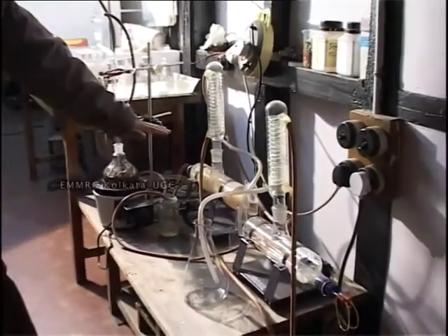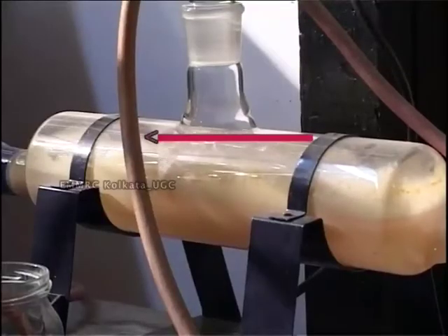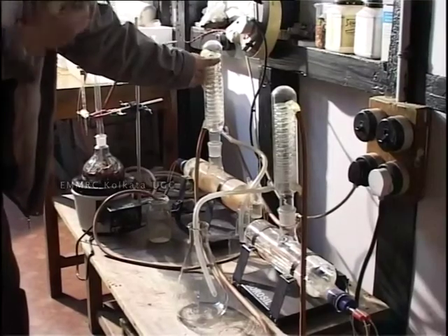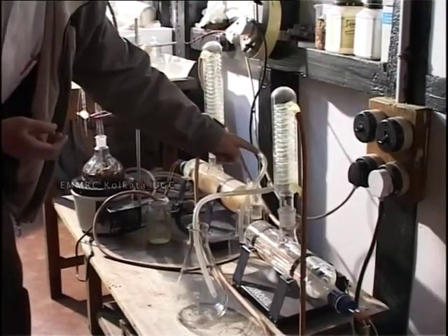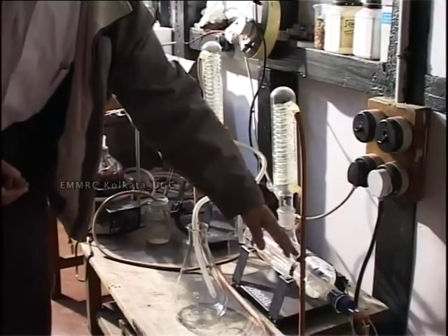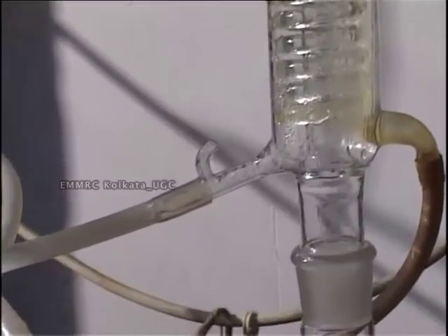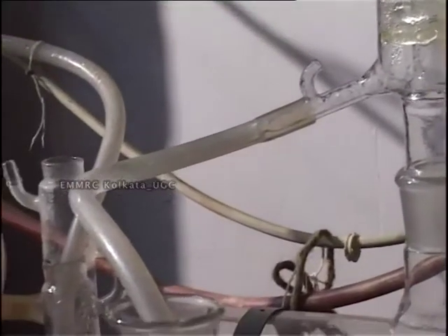This is a double distillation unit. The tap water enters through this pipe. When water starts boiling, the vapor rises up and passes through this pipe to the second distillation unit. This is the second distillation unit, where the same principle is applied.